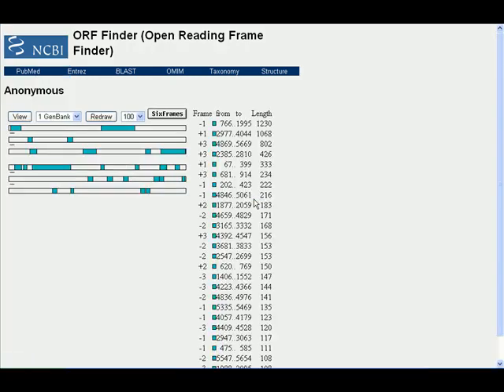This is our result page. We can see here all possible six reading frames in our sequence: one, two, three, four, five, six.